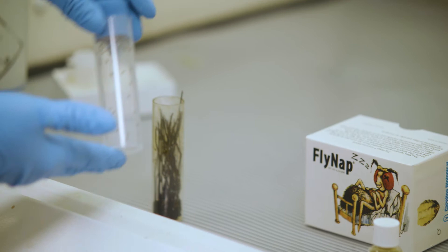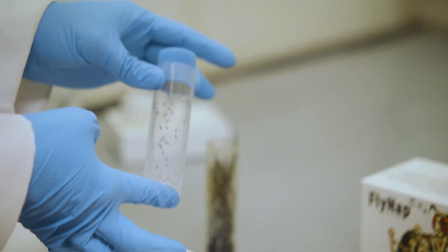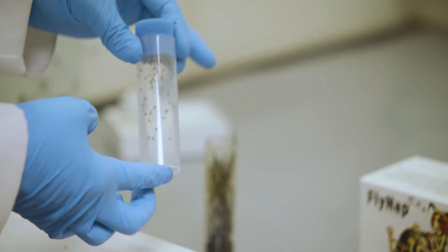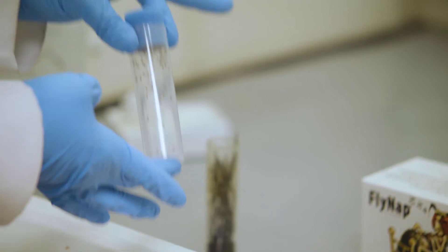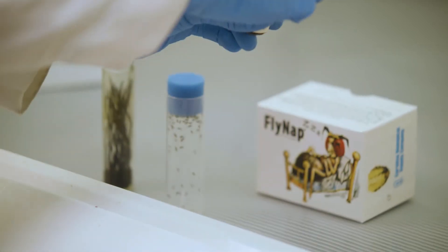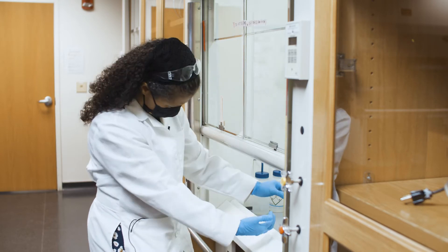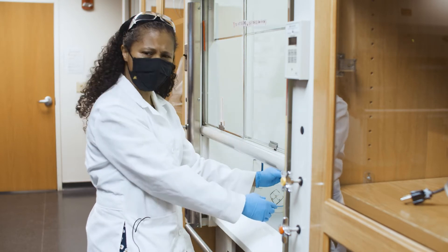Here's our vial of flies we are going to anesthetize. I put them into a vial without food so that when they do get knocked out they don't get stuck in the food. Here's the chemical that we're going to use — again, we are looking at FlyNap.